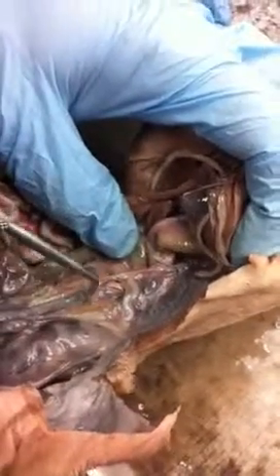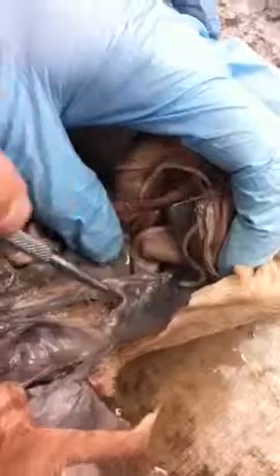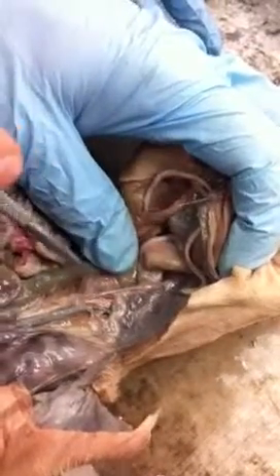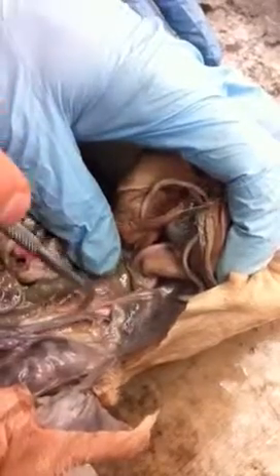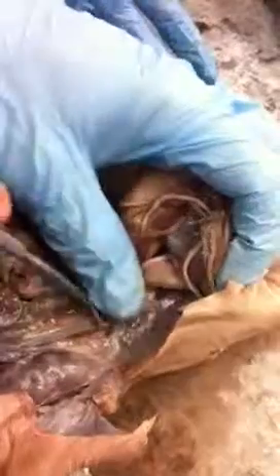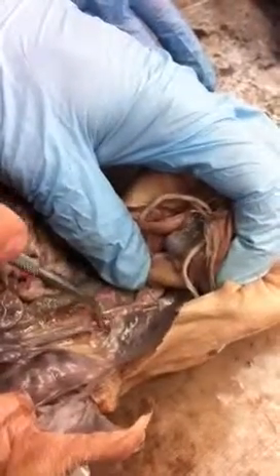Now, what about our common iliac? Yeah, iliac. Okay. Down here. We haven't gotten that far yet. So you got to follow this down, and down here it'll split. That's the ureter right there. Don't want to mess that up. So the arteries have split, so the veins must have split too.